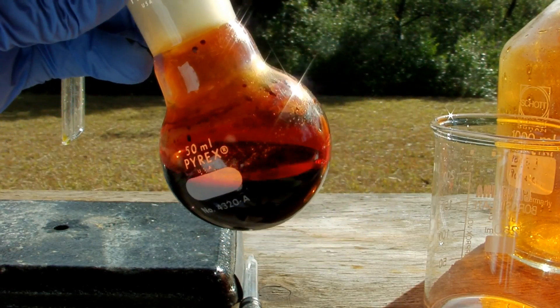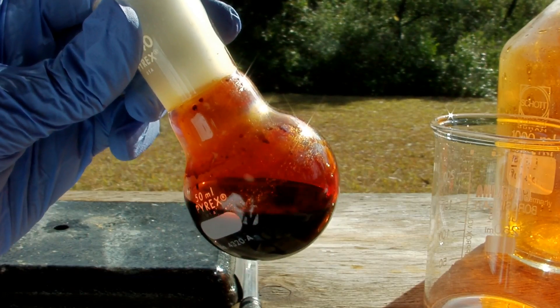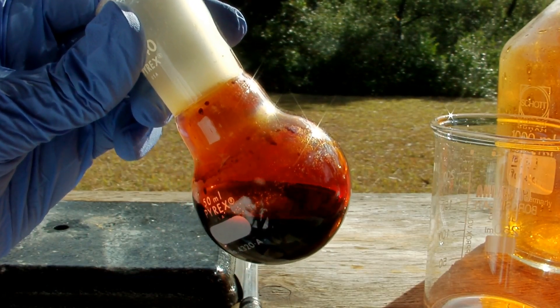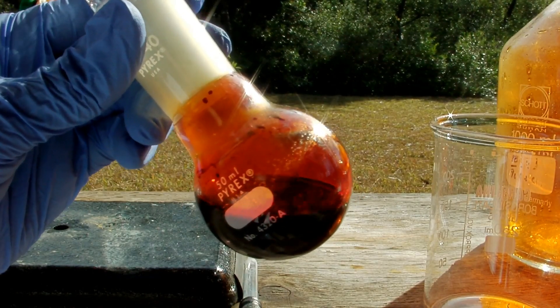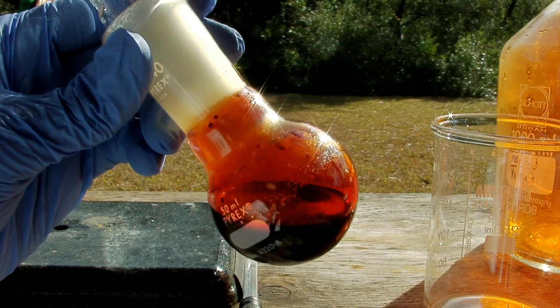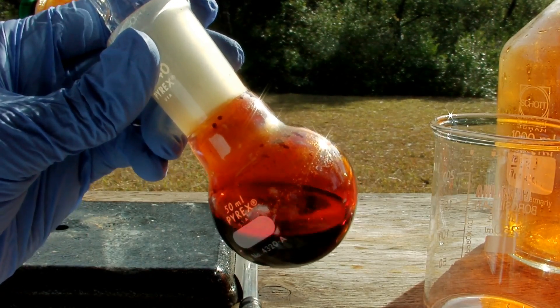Bromine is nearly impossible to store for any length of time. No matter what bottle you put it in, it's going to escape — it'll find its way out. So what I'm going to do is ampule some of this in a sealed glass container for permanent storage on my element display, and the rest I'll use up within the next couple of days in some other experiments that I'll be posting.